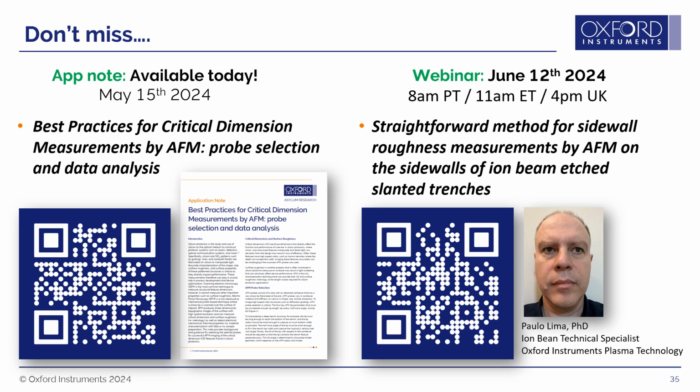One thing to keep in mind is that when doing so, you might change the chemistry of your tip, or it can even damage or dull your tip, because things can happen. But in theory, it is possible. So you can definitely try instead of throwing your tip away right away. Okay. Are there any special considerations for preparing samples for critical dimension measurements?